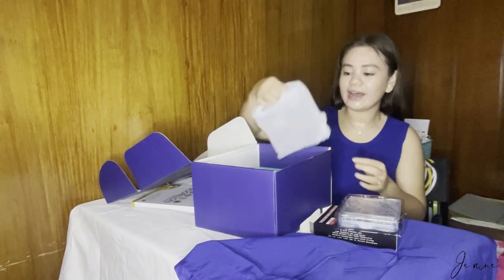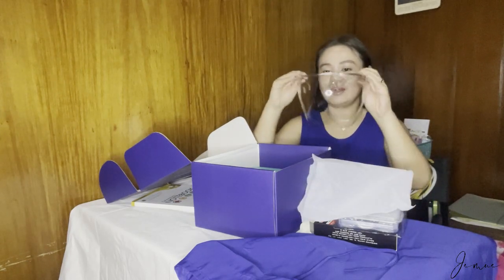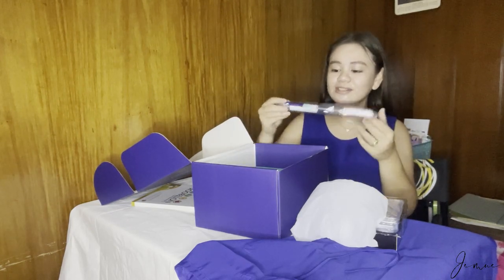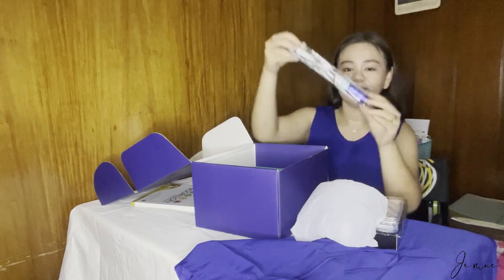We also have a face shield for protection habang maglalab tayo. Actually, lahat ng lab kit may face shield na nakalagay. Next, we have a digital thermometer.